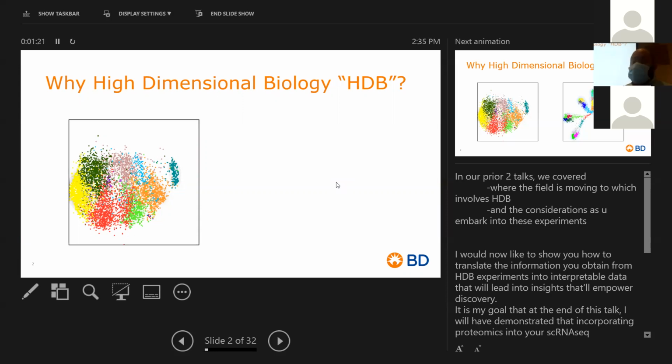I'm going to go over all those momentarily. But as you can see, it's a little bit of a blob because this is just mRNA sequencing. So with multiomics, what you get is being able to look at more than one omic, an omic being either the proteins or the mRNA. So in high dimensional biology, the idea is to try to acquire the most information possible.